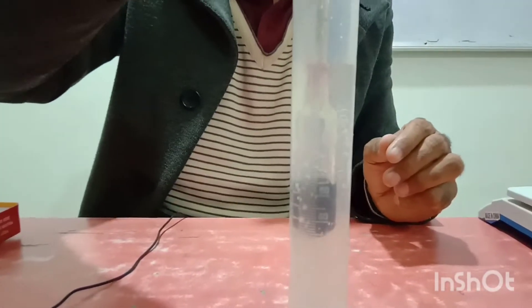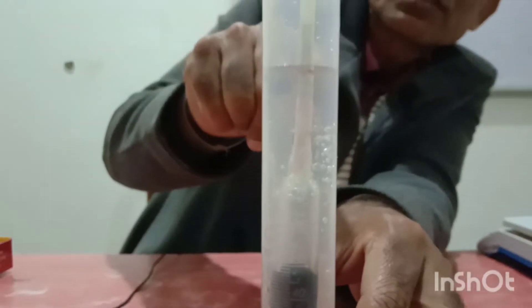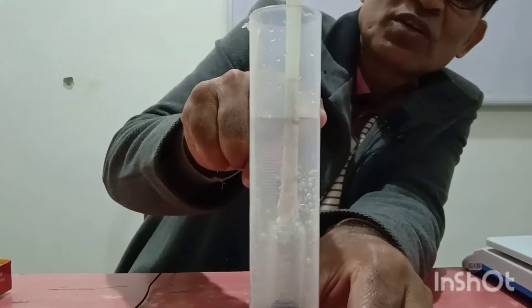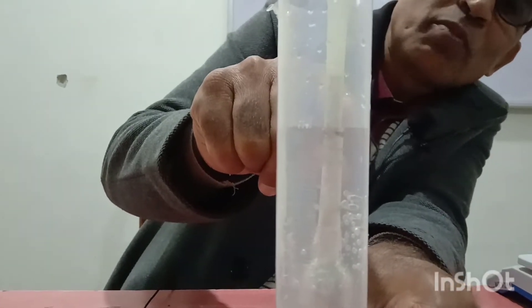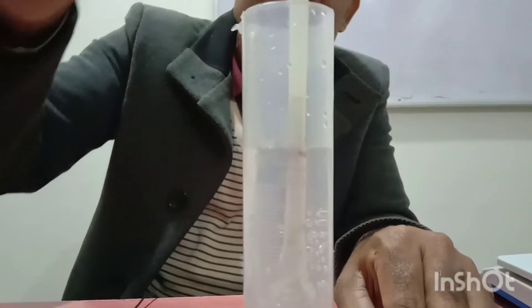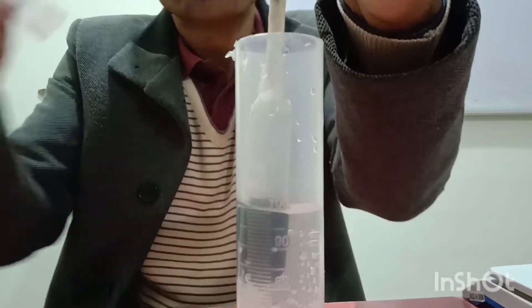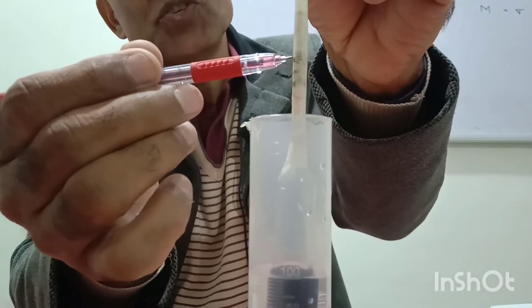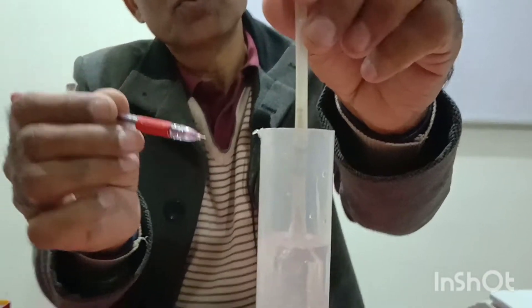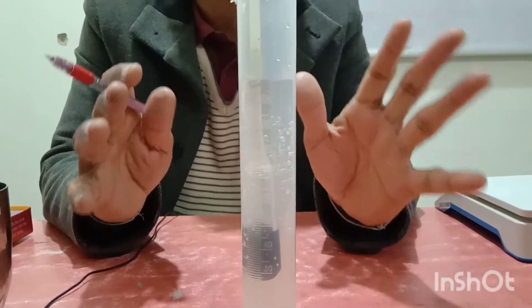Now we will check what is the level of the lactometer in water. You can see there is a black mark on this — the level of the water is at the top black mark. If I remove it, you can see this was the mark up to which it was dipped inside the water. This is pure water, and you know the density of water is 1 gram per cc.